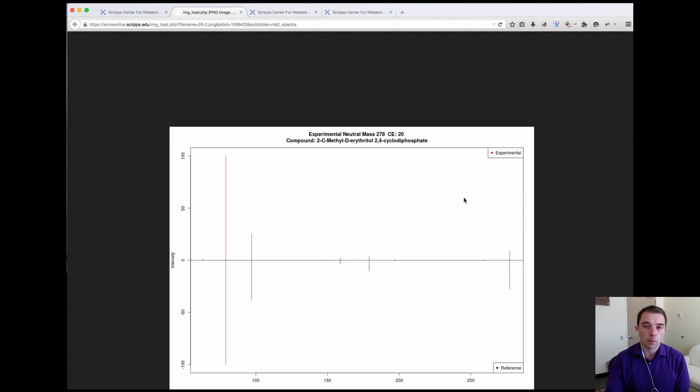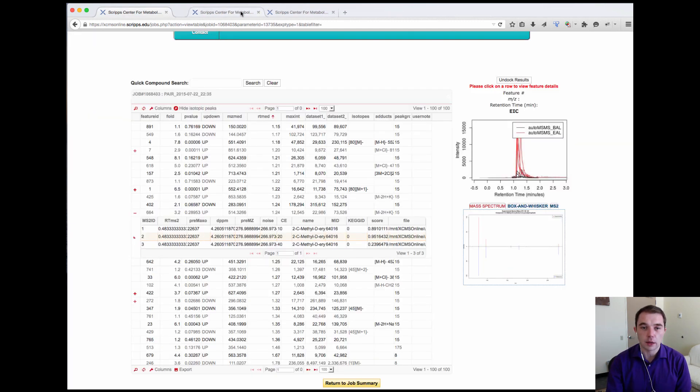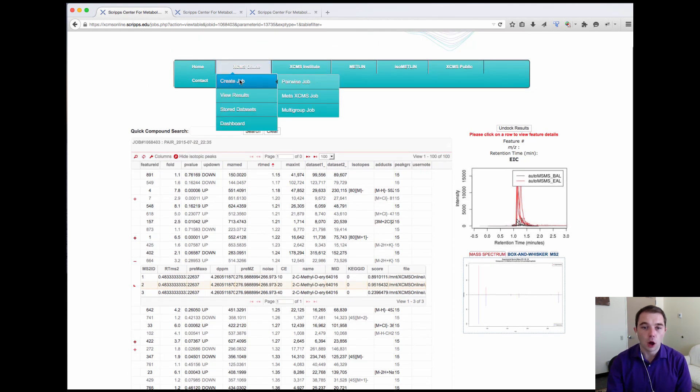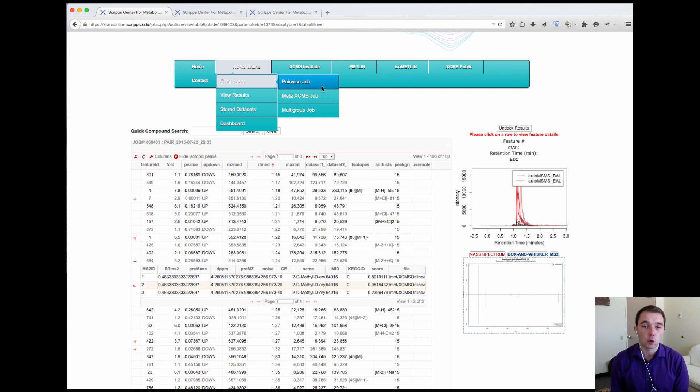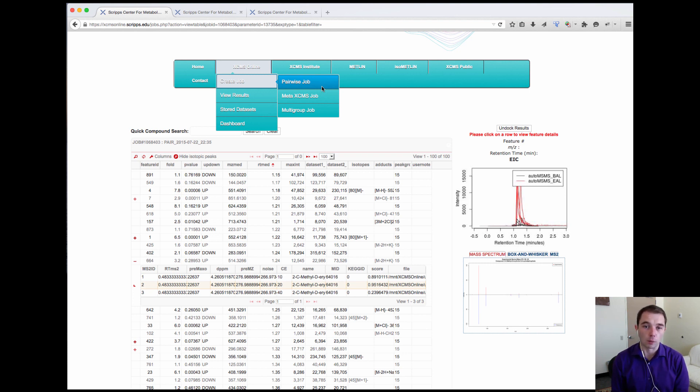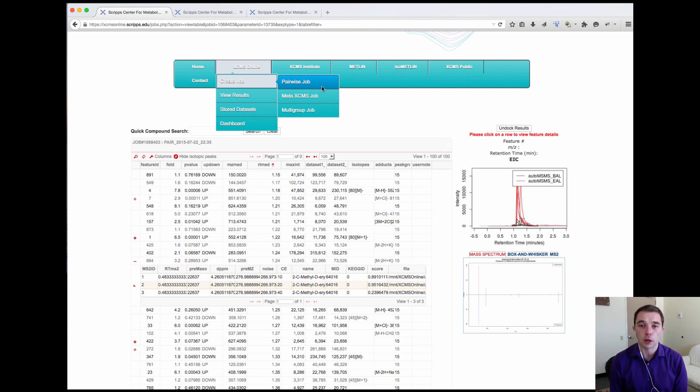Now you may be asking how exactly can I run this type of data? Well the great thing is that any one of the existing pairwise or multi-group jobs with uploaded MSMS data will already go ahead and process the autonomous MSMS matching. So there is no change to be able to run these type of jobs except for running and uploading MSMS data.